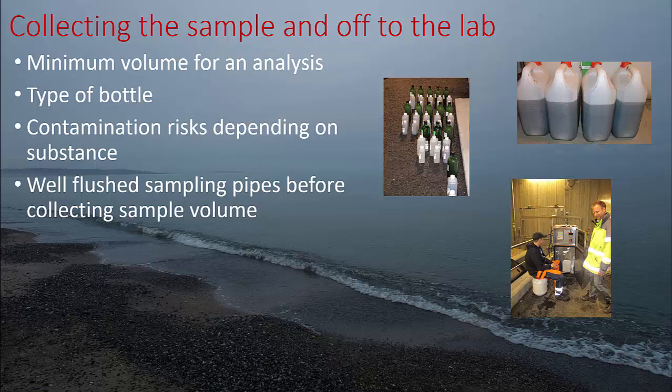I remember one time in a drinking water plant, we took some special samples, and suddenly we had bacteria popping up in our tests, and we couldn't understand why until I realized that the hose we had going into the sampler was very long. So over time, bacteria had started growing in this hose.